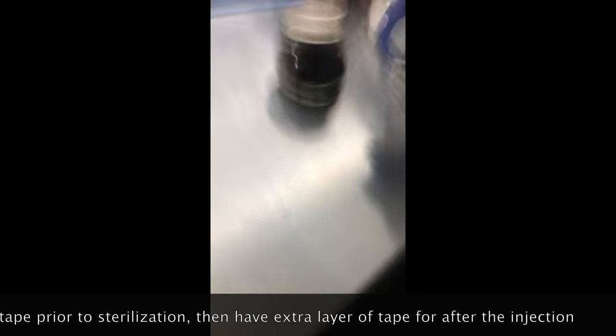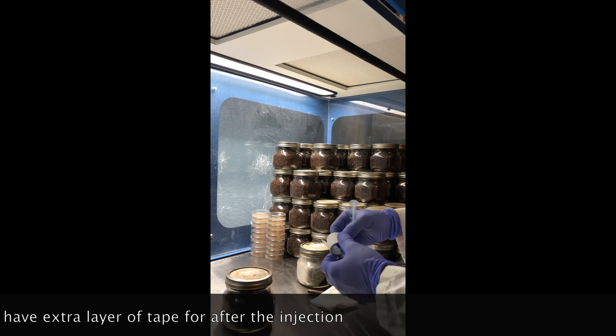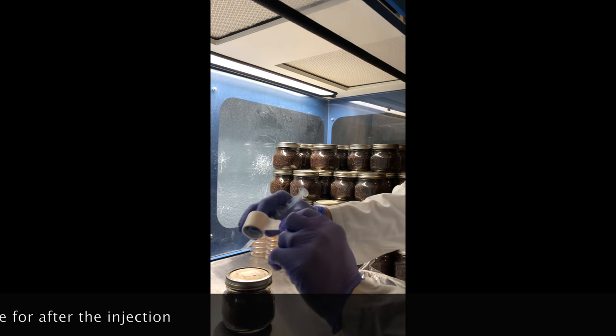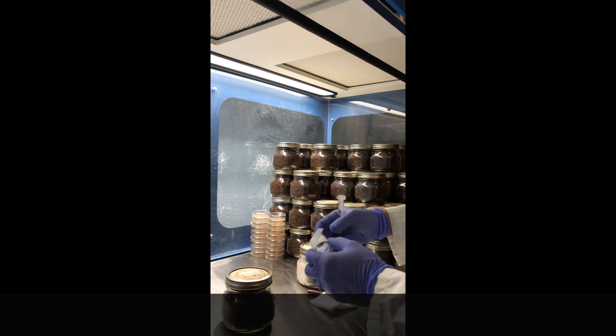I usually do about two layers of micro-pore tape after I inoculate. That way, it will prevent any contaminants from getting in your jar.